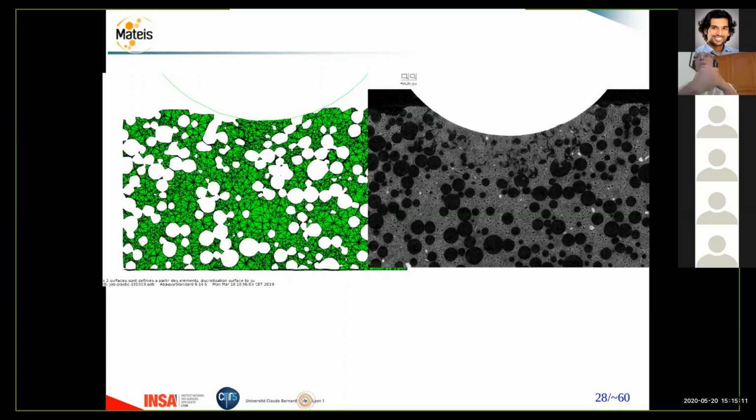So no X-rays behind the sample means no projection capabilities. So in this case, if your sample is very absorbent, like steel or concrete, you will have to reduce the size like this. And this way, you will have enough X-rays outside your sample, and you will be able to make an image. Okay, thank you.